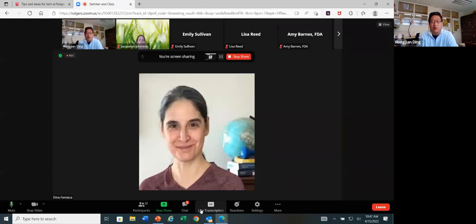That's our current approach. So for our daily samples, we do some analysis. Okay, I'm sure that's Tribolium. Some species go to genus. In some analyses, no, I'm not sure, so I just go to family level.